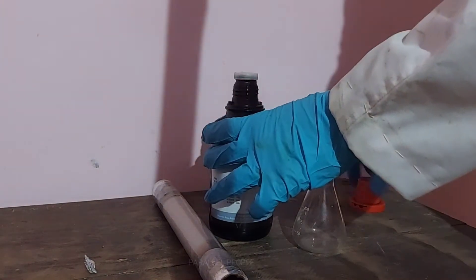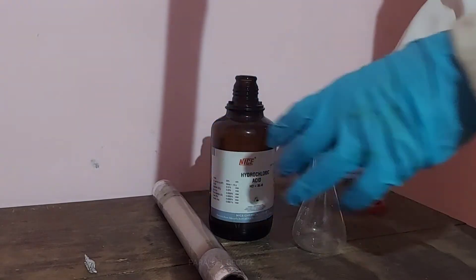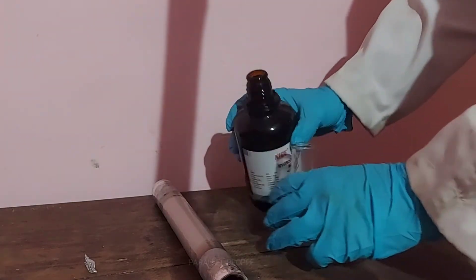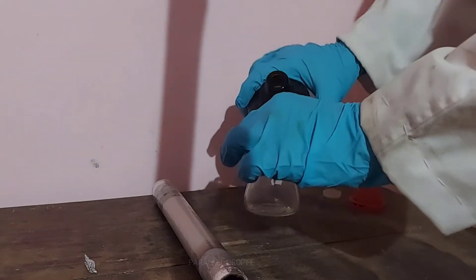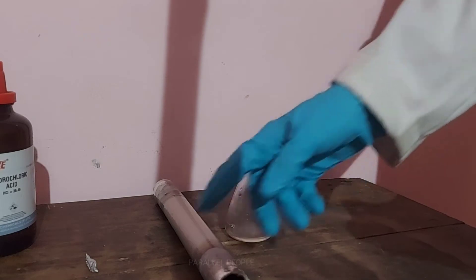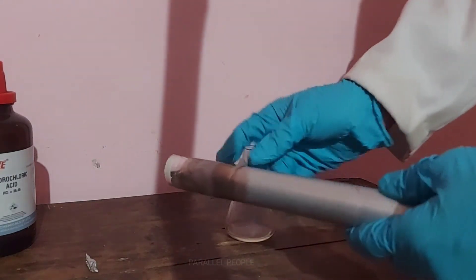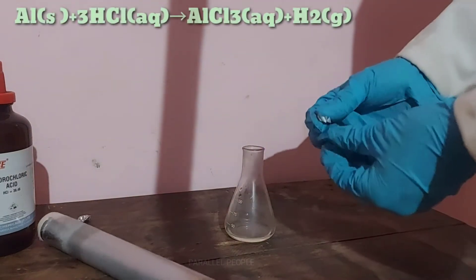First we need to pour some hydrochloric acid into the conical flask. Before going to the main experiment, let me show you the reaction between hydrochloric acid and aluminium metal.